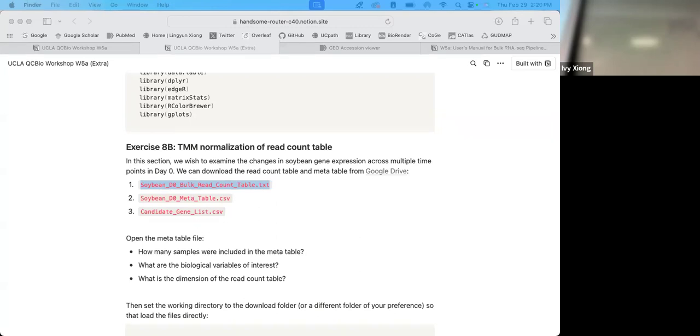I tried to do this afterwards, and it says there's no package called data.table. I don't think the download was successful. This keeps popping up. Do I even select yes to this one? Try.